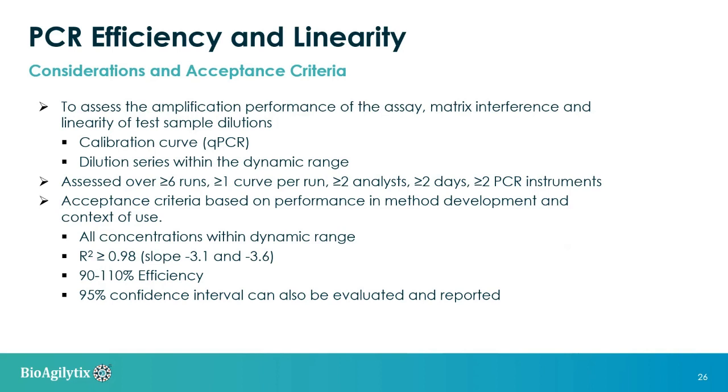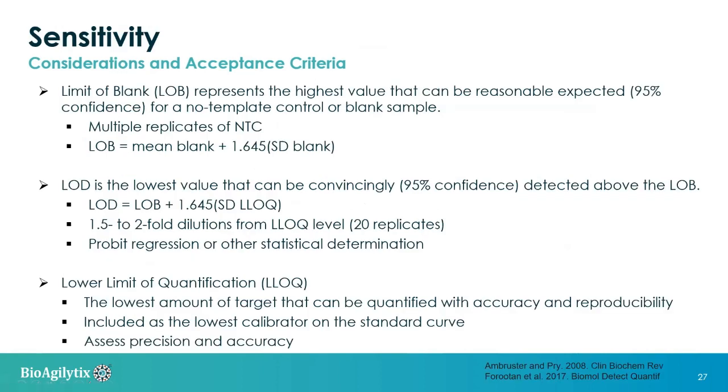And again, I will mention these are recommendations. The acceptance criteria should, although, be driven by method development and how your assay is behaving, as well as the context of use and how you're going to use it for testing.